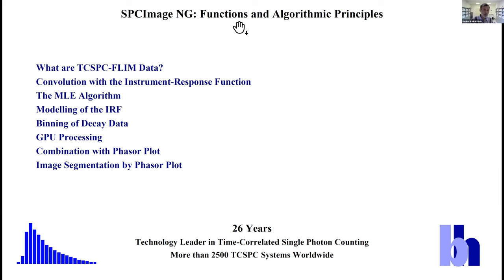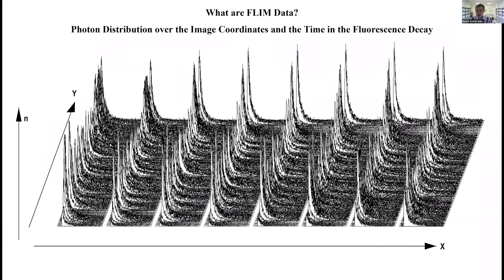So what are FLIM data? First point. I believe you have never seen something like this presentation of raw data of FLIM. What you see here is a photon distribution. FLIM data are photon distributions over the image coordinates x and y, and in every pixel you have a fluorescence decay curve in a large number of time channels.